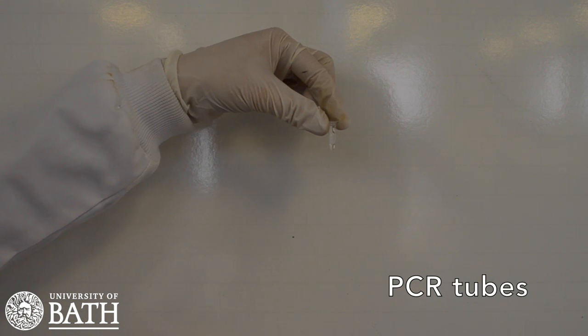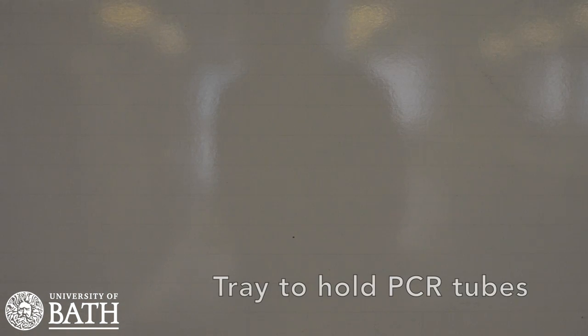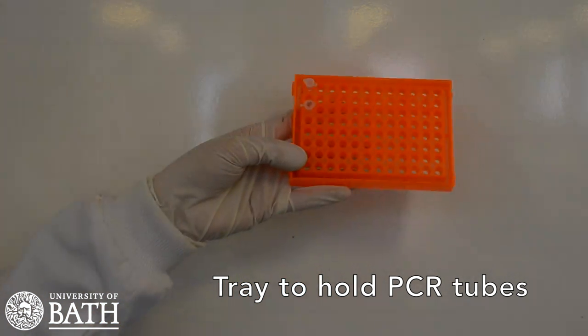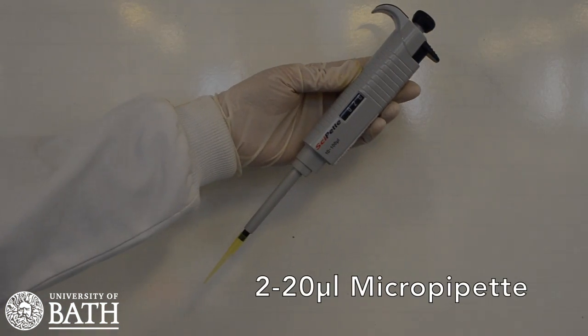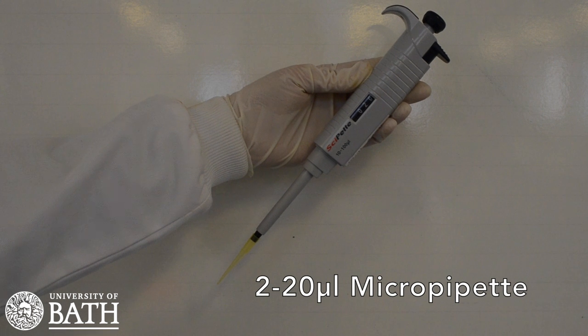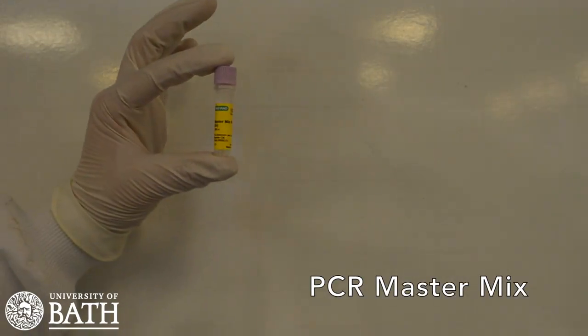For this lesson you will need thin-walled PCR tubes, a tray to hold the PCR tubes, a micropipette capable of pipetting a 20 µL volume, and the PCR master mix.